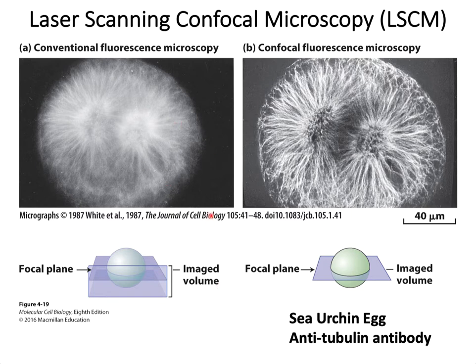You can see the tubulin fibers, but they are blurry because you are also collecting light outside the plane of focus. And then here is the same specimen with the image taken on a confocal microscope. You can appreciate a much clearer image and the detail of the structure you are staining as the focus is on a single point.